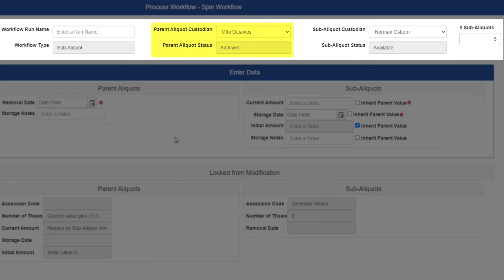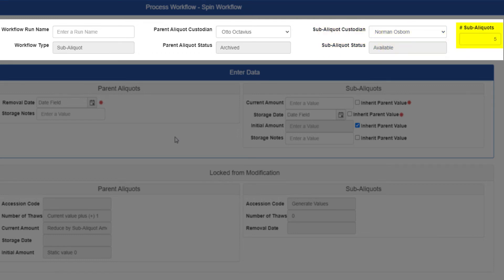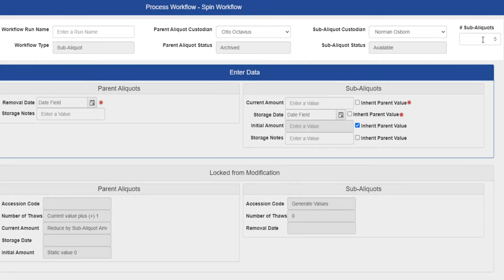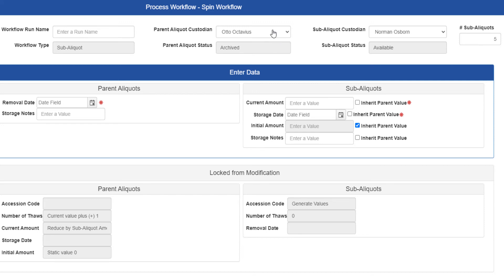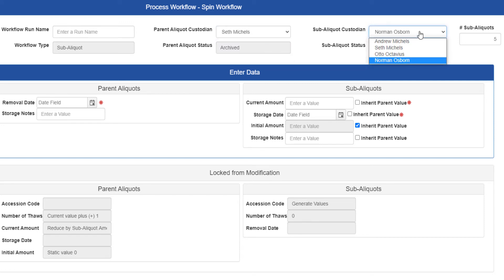The parent status and custodian fields determine the status and custodian for all of the aliquots you run this workflow on, while the sub-aliquot status and custodian fields determine the status and custodian for all of the sub-aliquots created through this workflow. The number of sub-aliquots field determines how many sub-aliquots will be created for each parent record this workflow is run on. By default, both status dropdowns are not modifiable at this time, so ensure they're set properly. You are allowed to modify both custodian dropdowns and the number of sub-aliquots field, in case you need to create more or less per parent than the default entry.